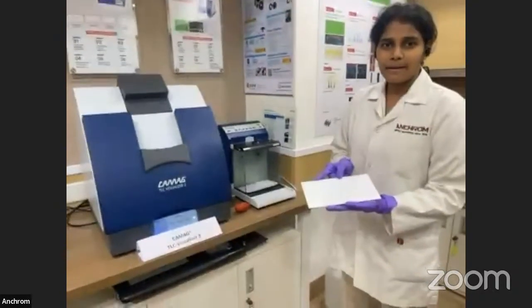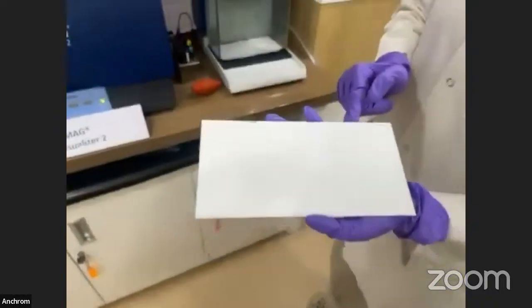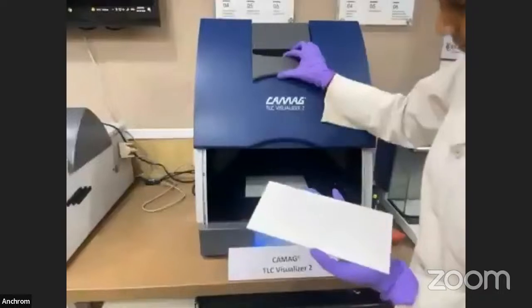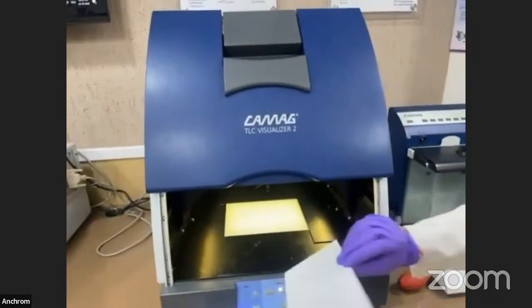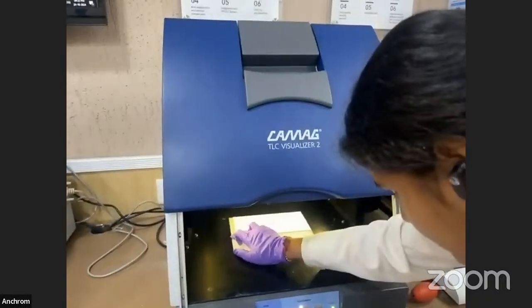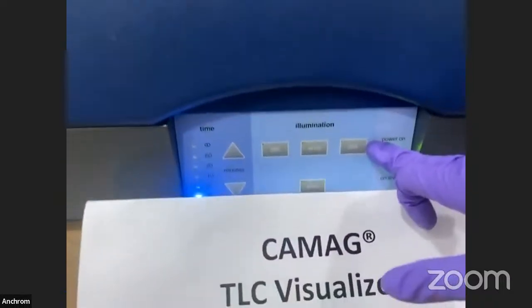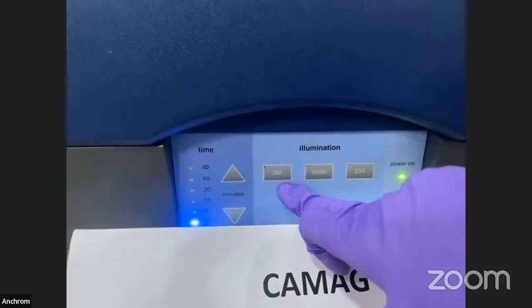So this is how the developed plate looks like. Now we'll be capturing the plate image of this developed plate within the CAMAG visualizer 2. As you can see, you can capture plate image under three different illuminations: 254, white light, and 366.